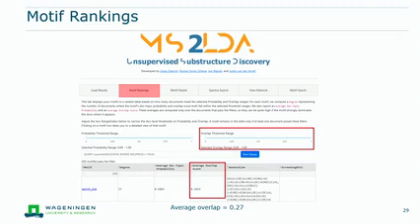What do you consider a good probability and overlap score? Yeah, so this is a good question. It's a little bit more difficult than this. Repeat the question. Yes, I can repeat the question. So the question was, what is a good average overlap score, maybe also probability score to look out for?